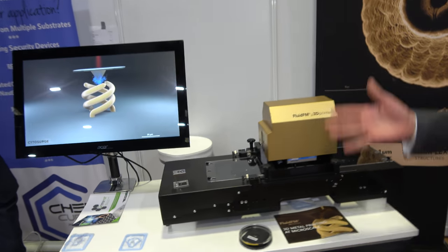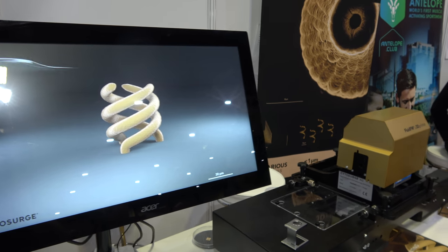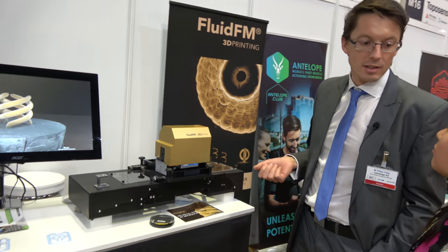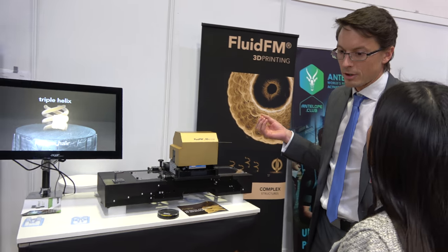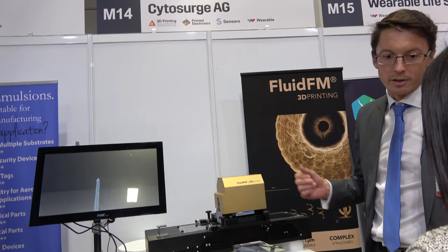So can you tell me a bit more about your printer? Basically, we have here our Fluid FM micro 3D printer. This is the printer which can print metal objects out of a solution at room temperature, in the size of micro objects, like one micrometer diameter, or even smaller or bigger.